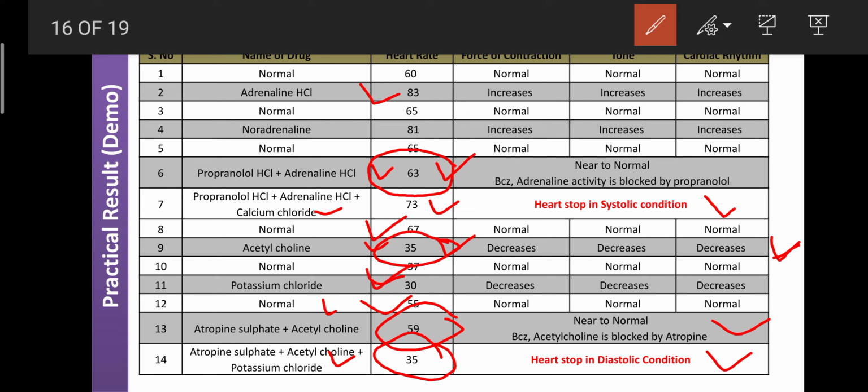Like that, if you have discovered any drug that can decrease the heart rate and force of contraction, it can belong to the antihypertensive drugs. That activity can be confirmed simply by taking the frog heart. Here you first record the adrenaline response, and later record the adrenaline activity in the presence of your drug.